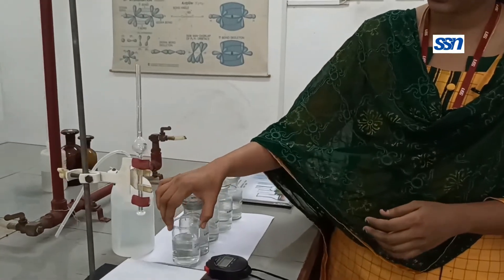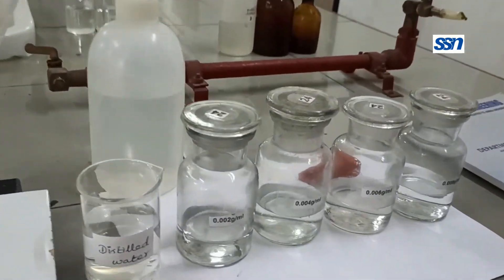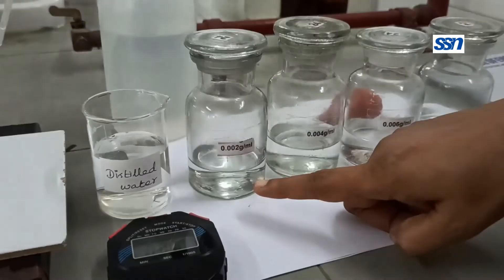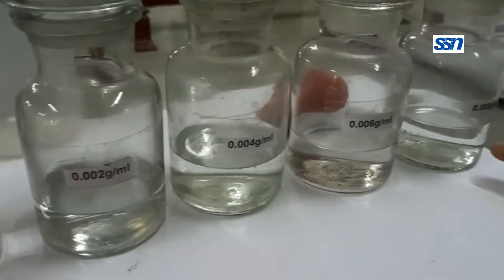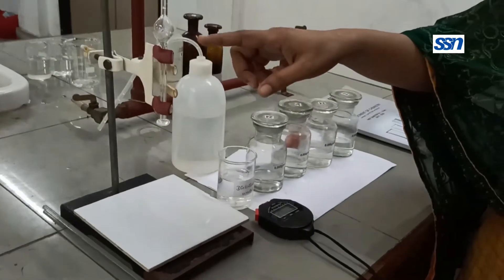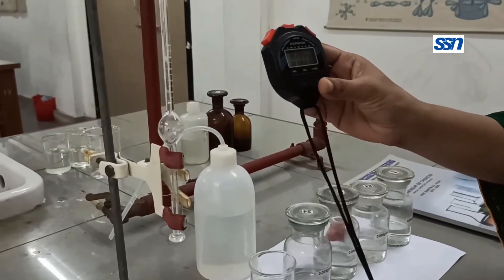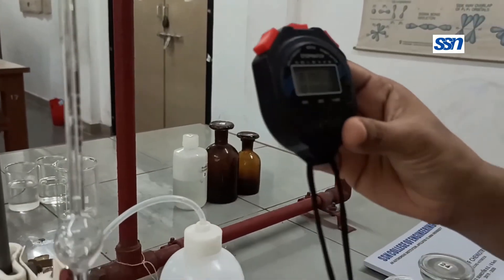Before getting started, let us see what apparatus are required for performing this experiment. We need a beaker with distilled water and polymer solutions of various concentrations. The polymers of various concentrations are arranged in order starting from lower concentration to higher concentration. We also need a viscometer and a stopwatch for measuring the time of flow of the solvent as well as the polymer solutions inside the viscometer.